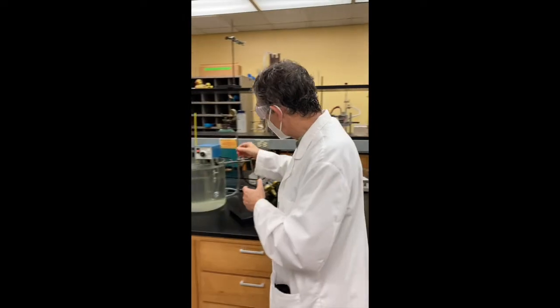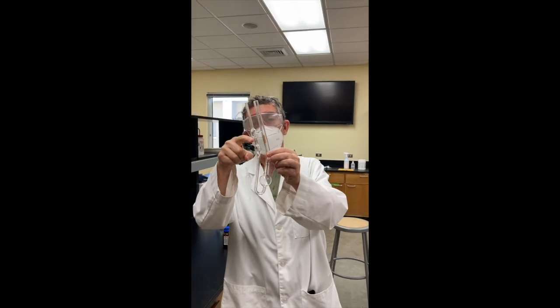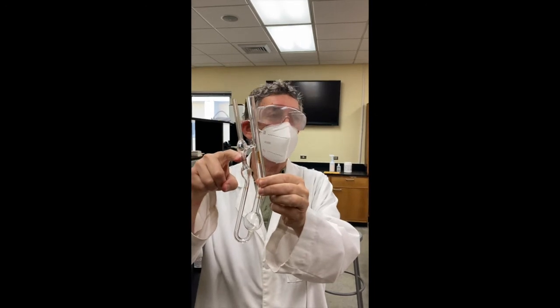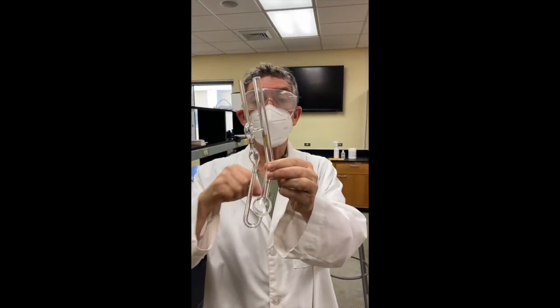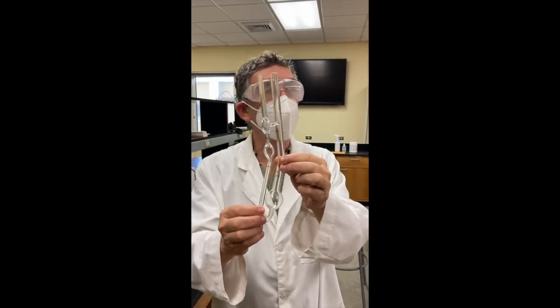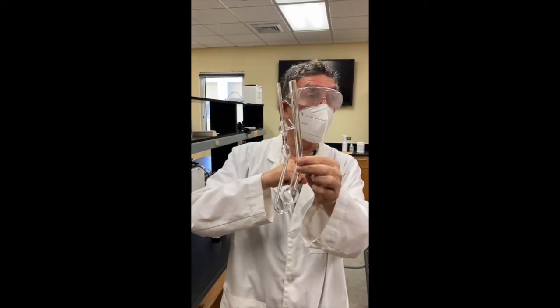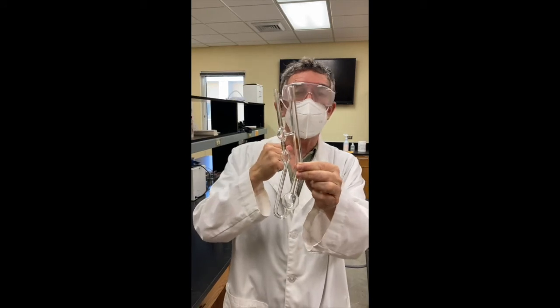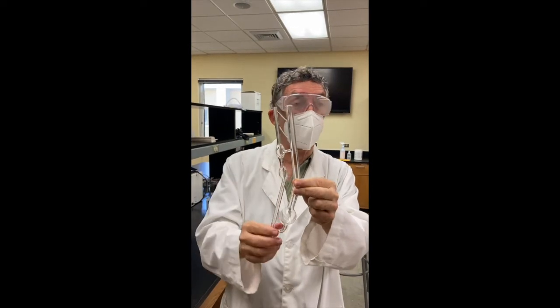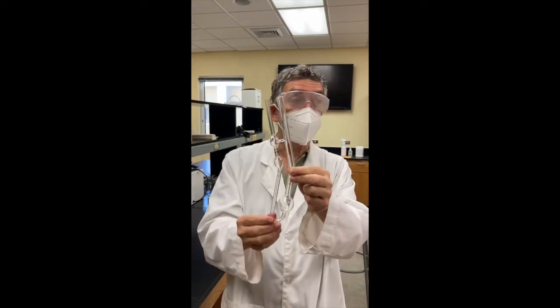you will ultimately be allowing your solution to pass through a very small bore. And this will be talked about shortly, and it's the length of time it takes the solution to pass through that bore that will determine the viscosity. This instrument's called a viscometer or a viscosimeter, either word does. Anyway, if you have small particles, they can get lodged in this bore, and you might not even notice it, but they'll make the timings irregular. You're short one time, fast the next, depending on what gets lodged in here. So you don't want the particulates, and that's why if you see them, you need to filter them out.